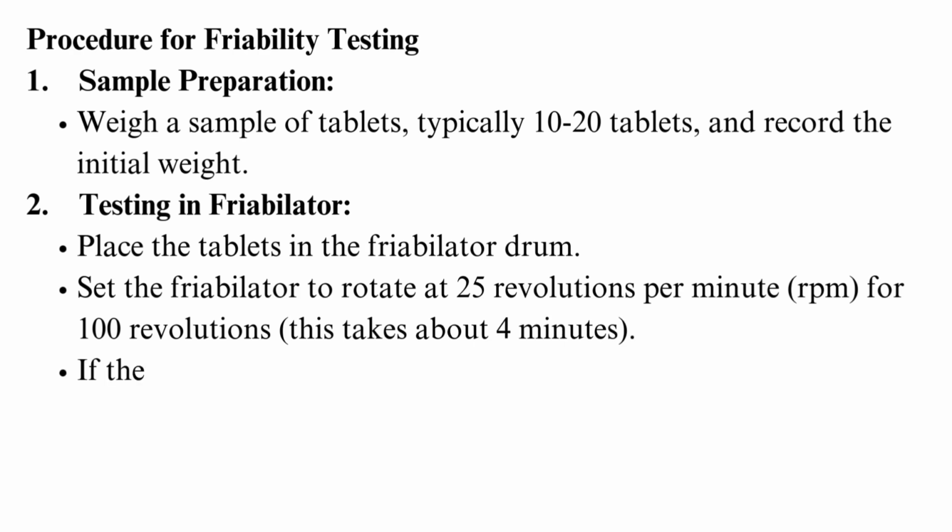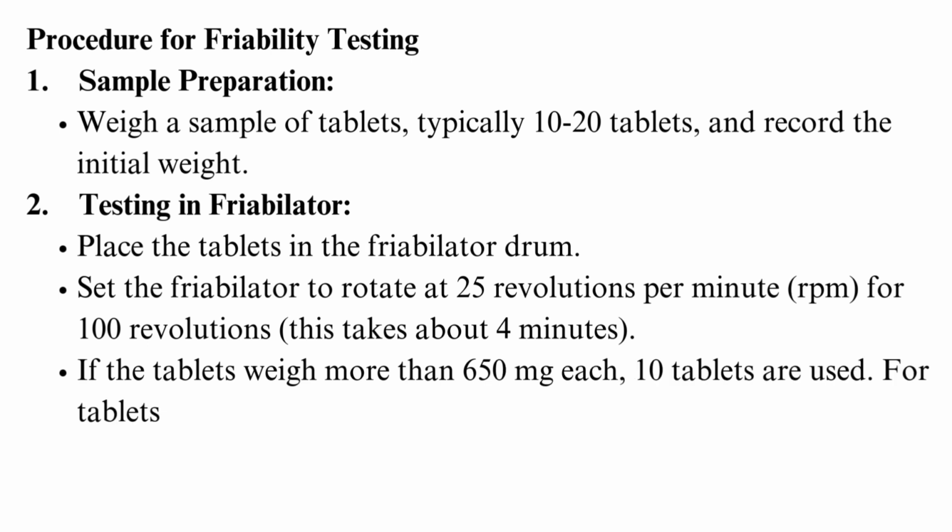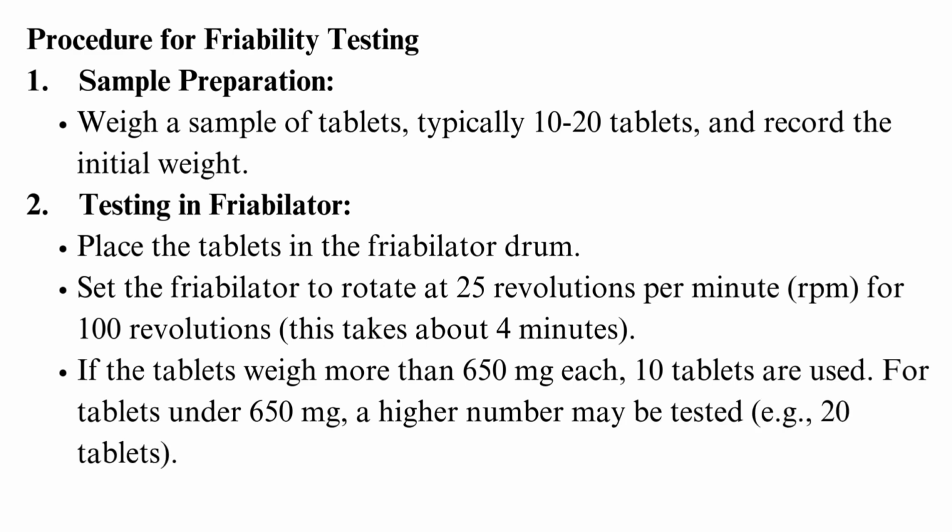If the tablets weigh more than 650 mg each, 10 tablets are used. For tablets under 650 mg, a higher number may be tested.